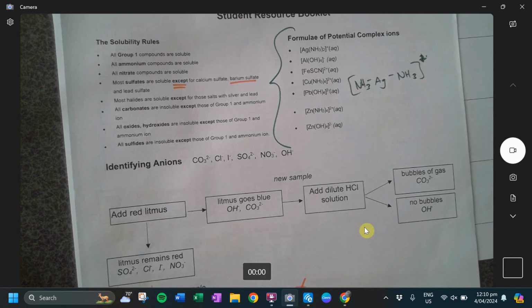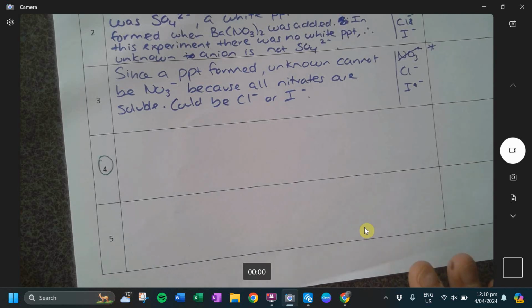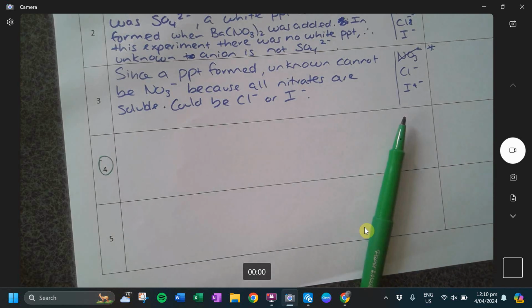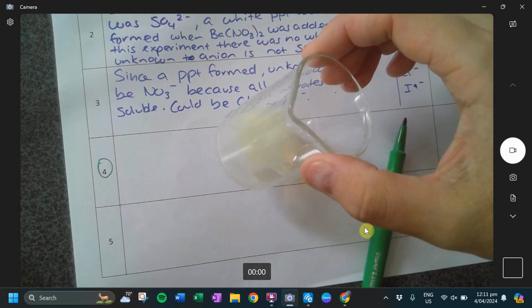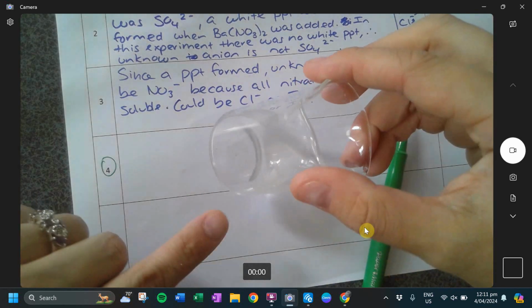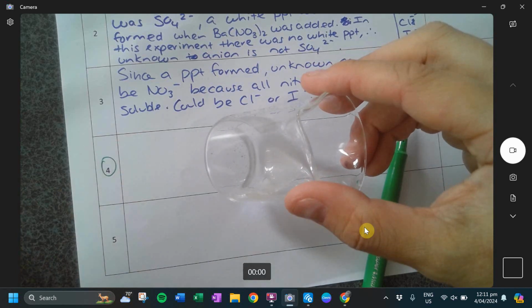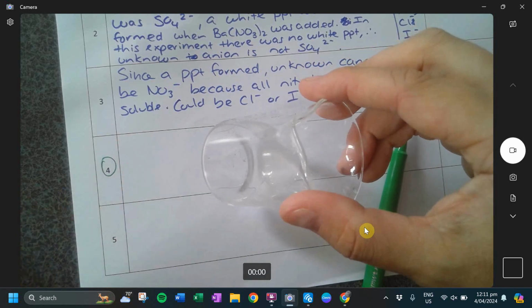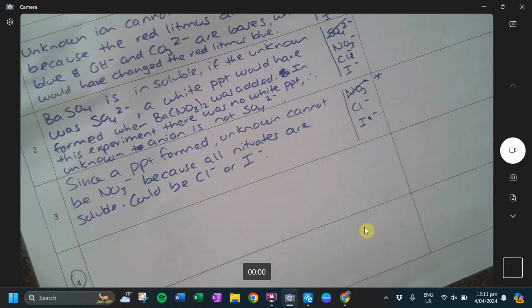The other thing to keep in mind is with the example of chloride, chloride can be displaced by the ammonia, but the ammonia cannot displace the iodide. So in the iodide, silver iodide remains because the ammonia cannot displace the iodide, so it stays as a precipitate. For the chloride, on the other hand, the ammonia can displace the chloride, forming the complex ion. So we lose silver chloride. That's our justification.